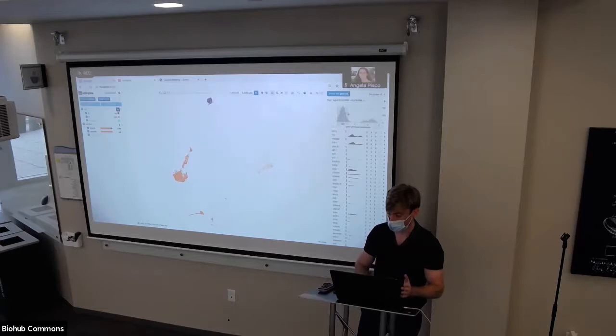And then it will select any cells that have within this range of gene expression. Because here, this particular histogram is reflecting gene expression. So you can see here, now we only have these top two left clusters selected and some at the bottom.